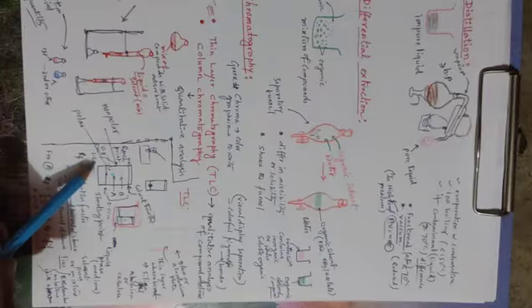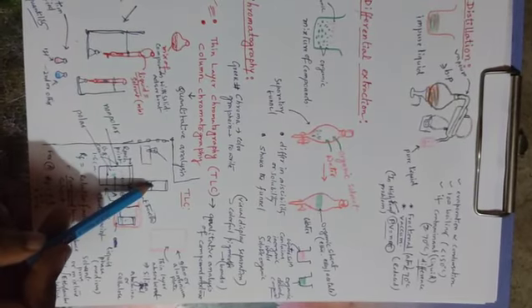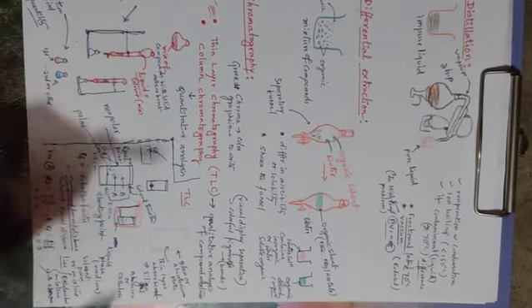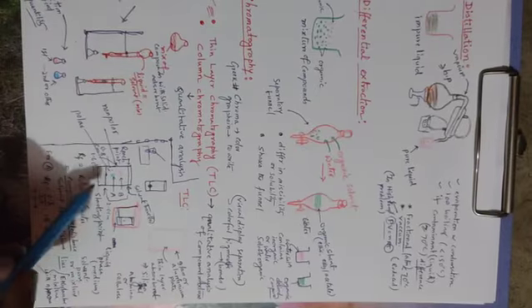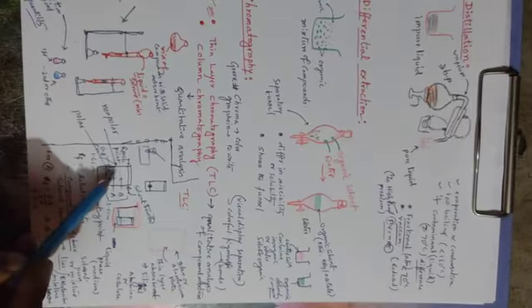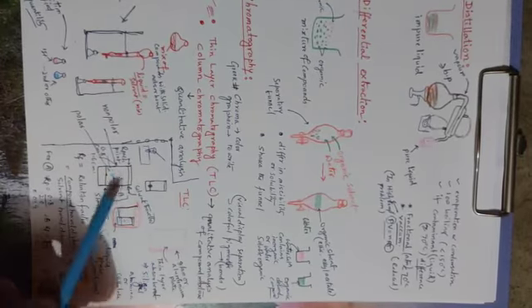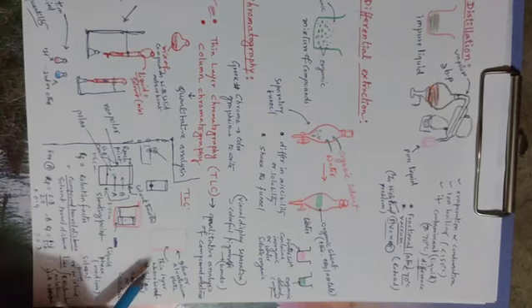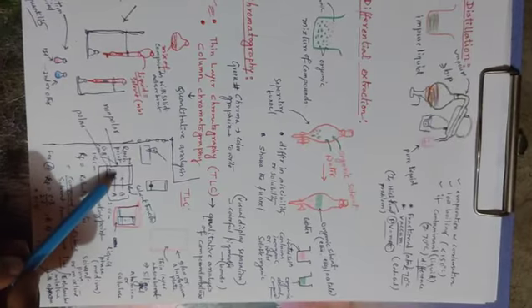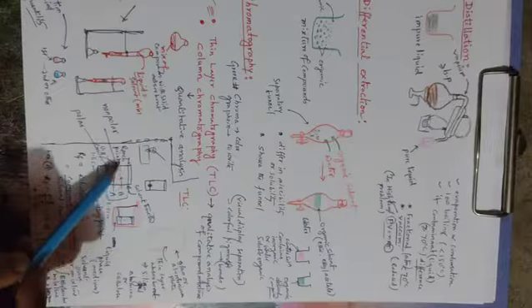Just to discuss more here, if we put the spot here, because of their different ability to bind to the adsorbent, the adsorbents being generally silica or alumina, suppose compound A moves here and compound B moves up more.